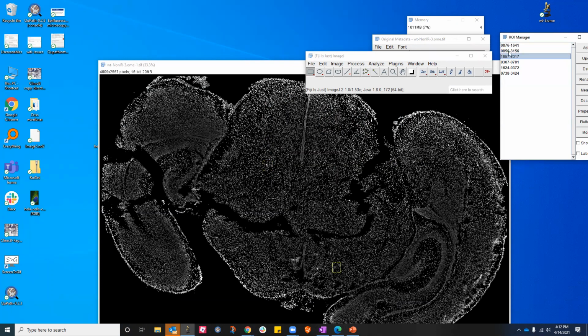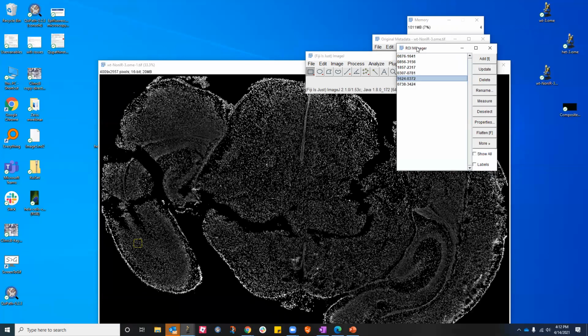And we can go and visit each of them again. Very cool. Okay. So the ROI manager feature is extremely important for data reproducibility. Especially, let's say in future when you acquire, or this is for anybody who has got larger data sets.